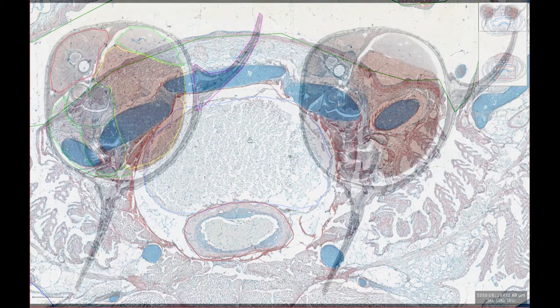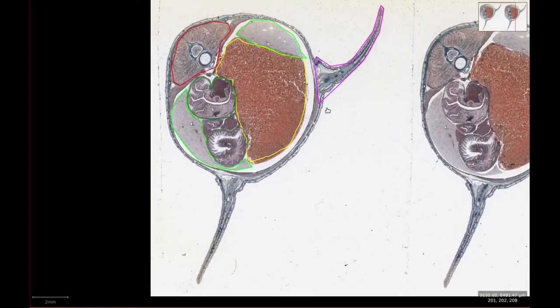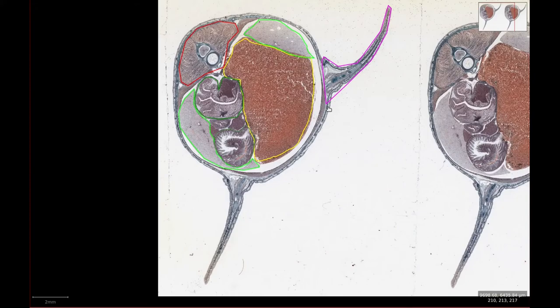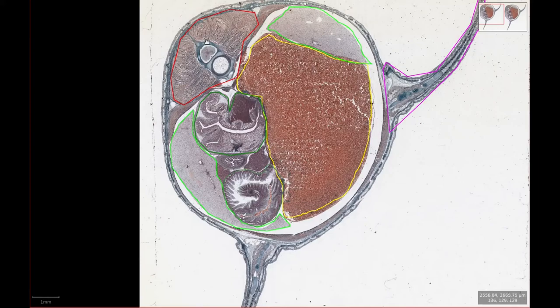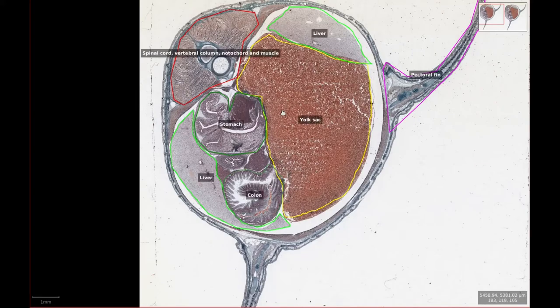The final slide in this series is 249, which is taken through the coelomic cavity at the level of the pectoral fins, which we can see coming off on either side. Similar to 246, there is the spinal cord, vertebral column, notochord, and dorsal muscles at the top. Within the coelomic cavity we have good views of all of the major organs, including two sections of liver and a section of stomach, colon, and yolk sac.